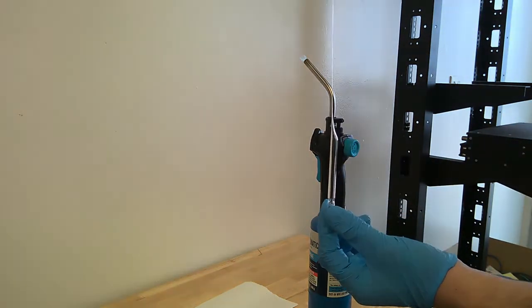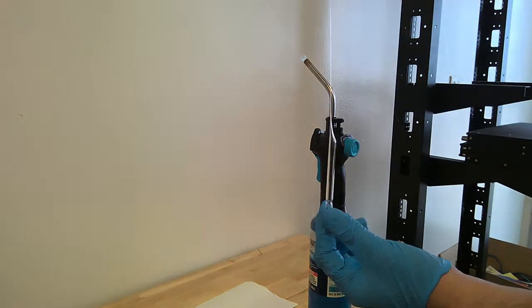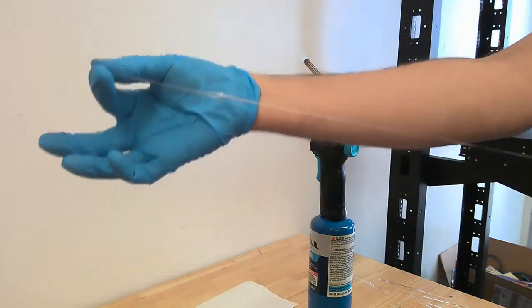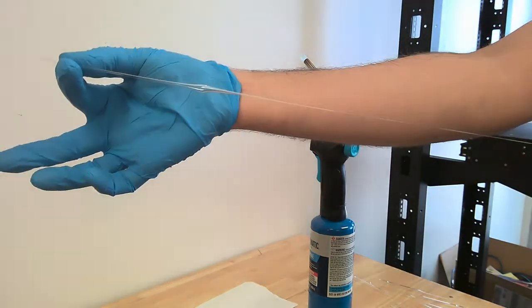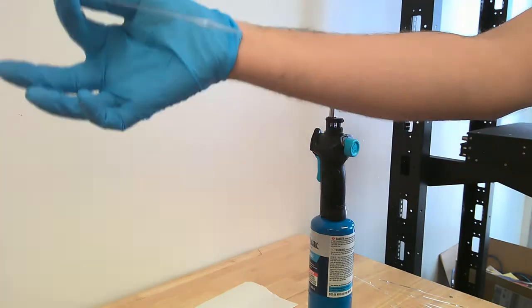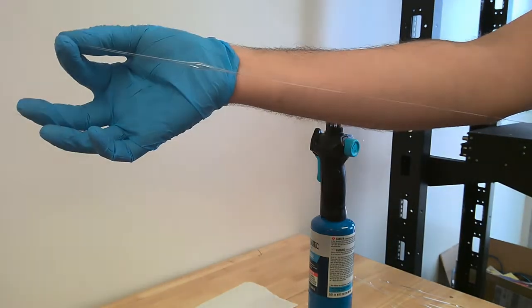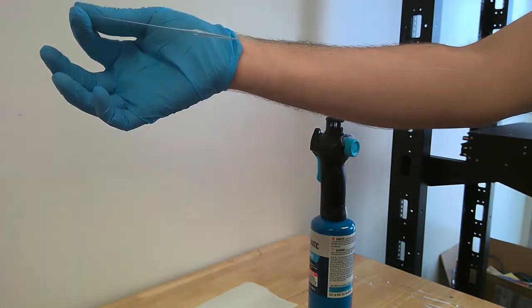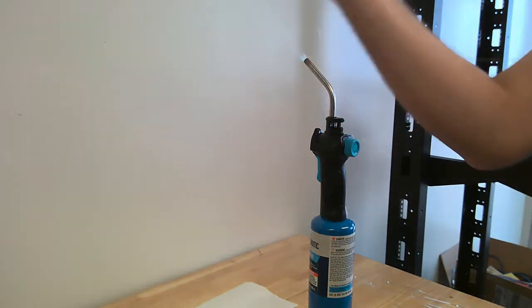As you can see, we have a long, thin piece of glass that we're going to use for our capillary bells, and we have a region at the tip, at the end, that we're going to use for our micropicnometer. We're going to allow this glassware to cool, and then we'll continue by showcasing how to prepare a melting point and boiling point capillary.